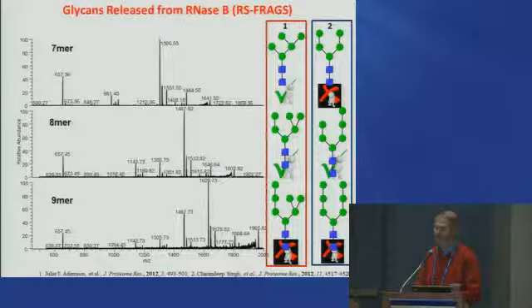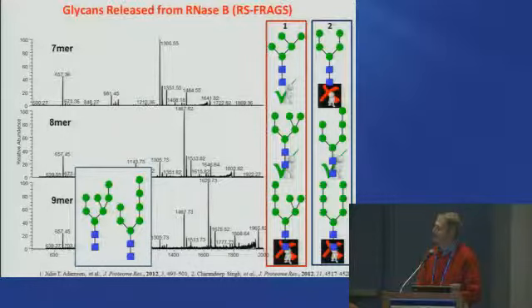They're both wrong. And in fact, the two possibilities that one has for the 9-mer, I'm not going to show you all these data, are this, okay? After the first branch, there are 4 of the mannose subunits on one of the 2 branches. We can't actually distinguish this one from this one, unfortunately, but we know it's neither of those.